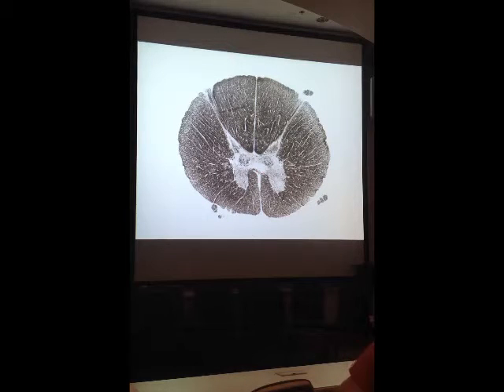what dark stain structure is that right there? Anterior white commissure, anterior white commissure. In addition, you should know the major ascending somatosensory pathway that fills much of this area through here. And what pathway is that? Spinothalamic tract or anterolateral system. Again, it's tough to ask, I think, Lissauer's tract, but there are Lissauer tract fibers through this territory.